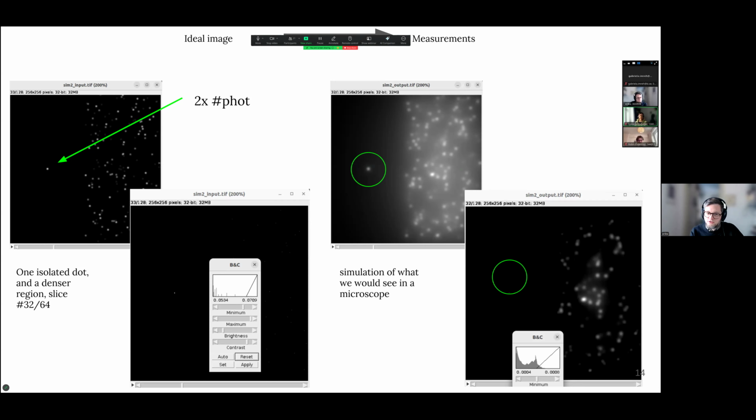For other super resolution techniques, the situation is better, of course. So the main reason here is that you want to be able to detect the bright spots, and if you want to know which are the brightest, you need to do something at least.